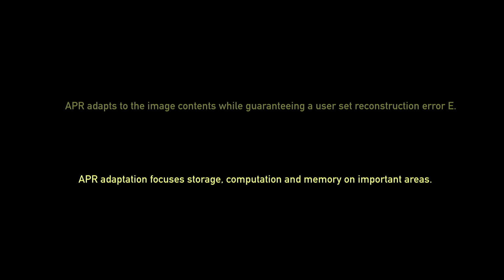But the fundamental idea is that the APR adapts to the image contents while guaranteeing a user-set reconstruction error, E. And the idea is that this adaptation focuses storage, computation, and memory on the important areas.